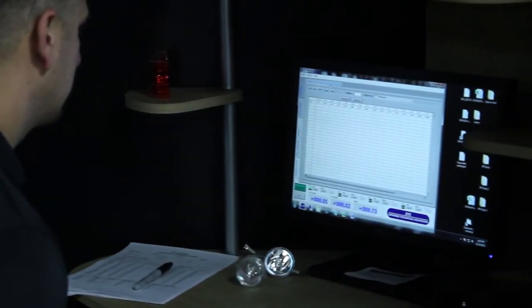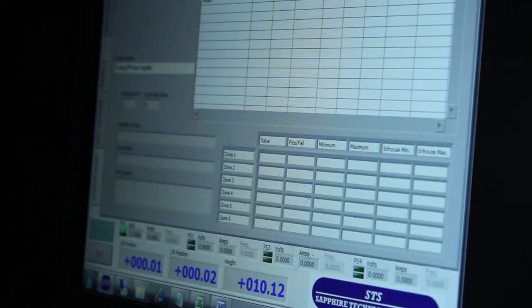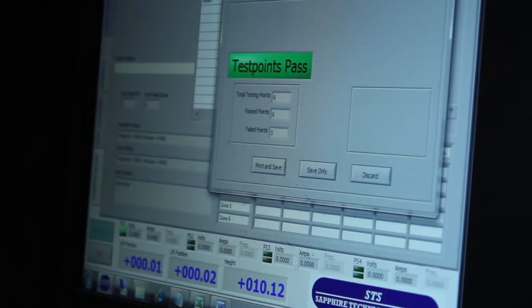Again, this is a three-part system, so this being the third part. This third computer allows us to maintain accuracy.